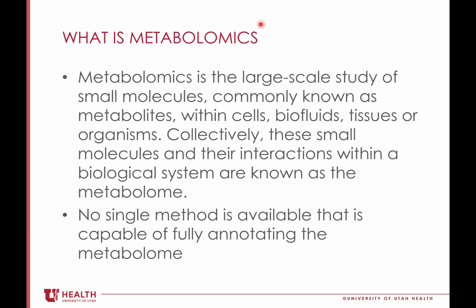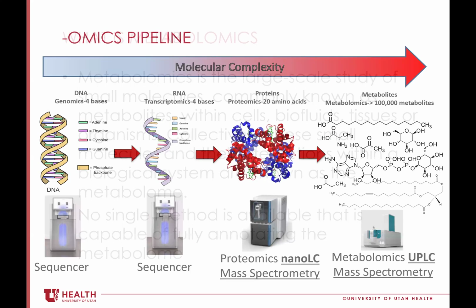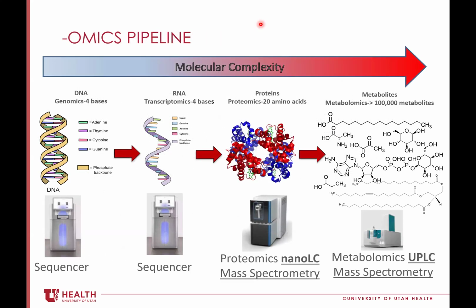And what I really want to stress right now is no single method is available that is capable of fully annotating the metabolome. We're just going to go through this point in some finer detail in the next 40 minutes or so. And so, where does metabolomics fit into this omics pipeline? That we're going to be talking about in the next couple of months.